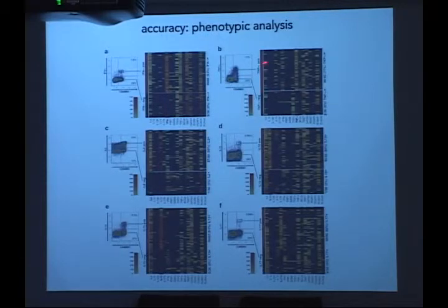So we validated this for 6 different cytokines, and we get 80 to 90% on average hitting the positive here. And we get a very, very low false positive rate, which I'm not going to show you the data for, but we think that these cells are really cells that do express the genes, but for some reason are not expressing the protein. So we get really high accuracy on all the cytokines we've tested.